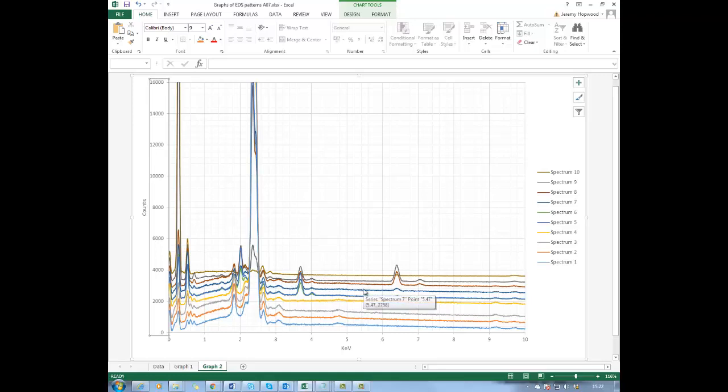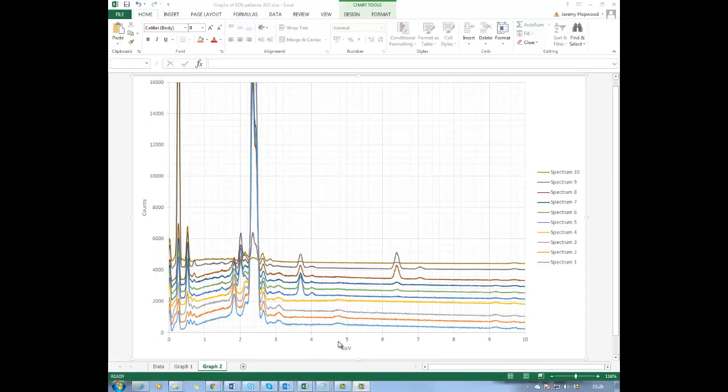Basically, you want a set of lines where they're sort of apart from each other. If there's a similar distance apart, that's great. It just visually looks better. So that's what I'm going to go and do now. So now I've got them all stacked and they're all looking better.